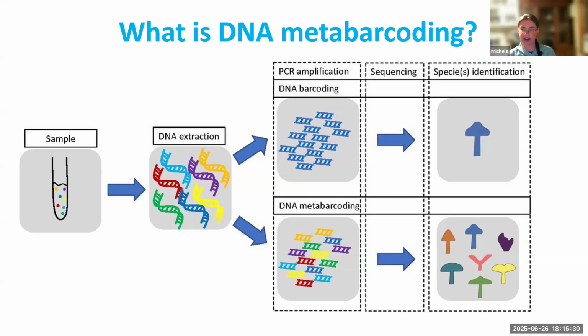Metabarcoding, on the other hand, imagine if I'm standing on top of that stadium and I take a snapshot of everybody in that stadium and immediately I have everyone's identification. That's the difference and that's the power. You can basically interrogate a sample with a specific group of organisms in mind. Maybe you're just looking at the plants, maybe the bacteria, maybe the fungi, but you can identify all those things in one shot in those samples.